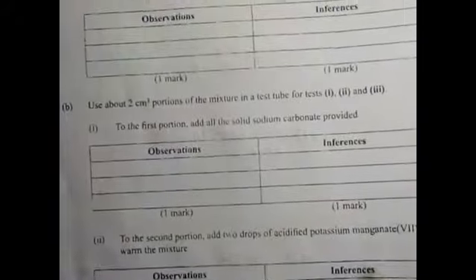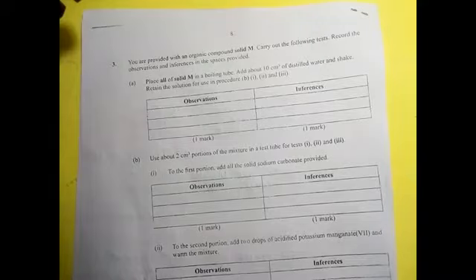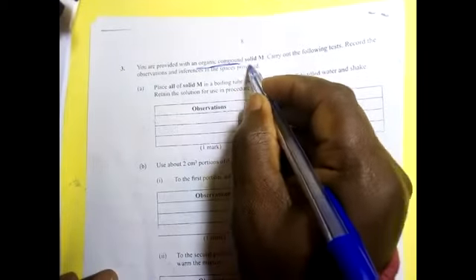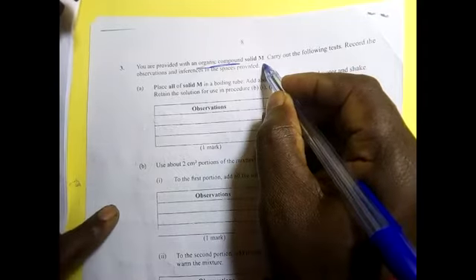The last part, we had the organic. You are provided with an organic compound. Here you have been told that you have organic compound solid M. That is a very important information.